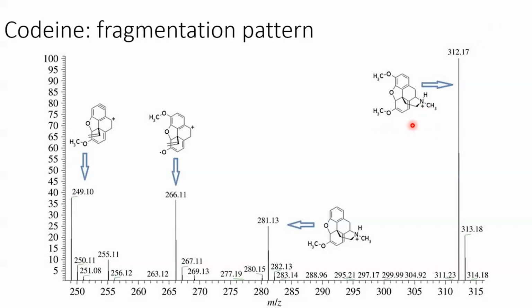But what's interesting is, as part of the initial treatment that you apply to your sample when you inject it into the mass spectrometer, it essentially gets showered with energy. So basically, to form ions, it absorbs quite a lot of either electrons or charged particles, something to give it that ionic form that's needed to pass through the instrument. And in doing that, the molecule absorbs quite a lot of energy. Sometimes it can just sustain that energy and it comes out the end as the molecular ion, but sometimes that energy is enough to trigger a fragmentation process in the molecule.